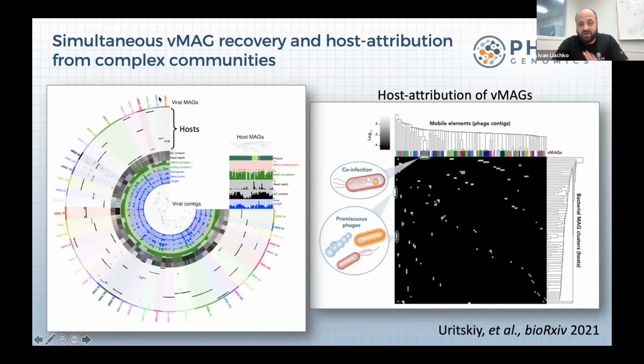We've shown, again, benchmarked against long read assemblies where the entire phage is a single contig, that it's a surprisingly accurate way of doing this. The cool thing about it is that this is all done from shotgun Illumina data, right? This is all short read data. It can be done on long reads as well, but from short read data, you're able to pull out something like 2 to 3 times more phages than you would from long read assemblies, simply because Illumina reads are better at reaching into the low abundance parts of the metagenome.